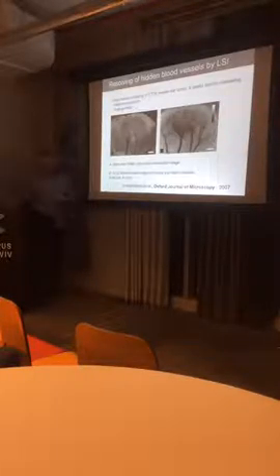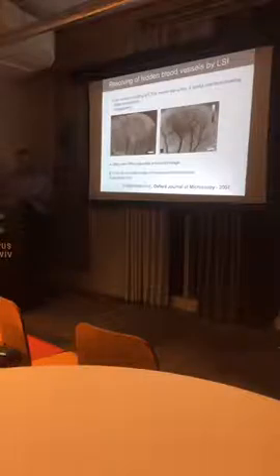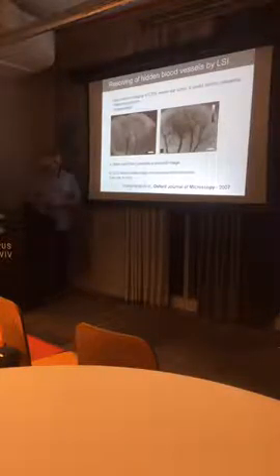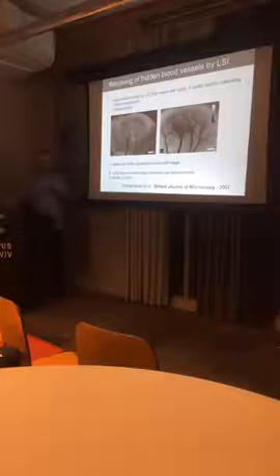Yes, I'm sorry. I have to be on time, but I'll show you. The speckles are kind of modulation of the light? Speckles are an interference pattern that any monochromatic coherent light produces. No, but you are using it as a kind of modulation of the light? No, I don't modulate anything. This is the whole idea.